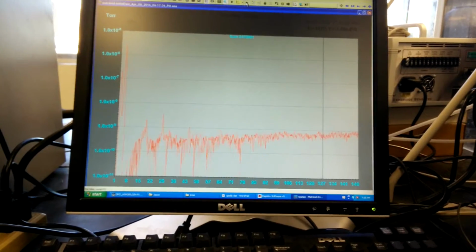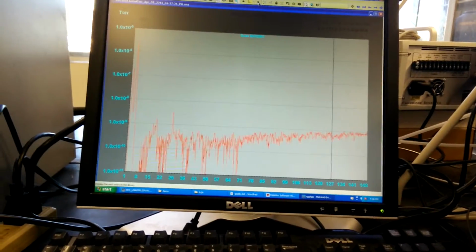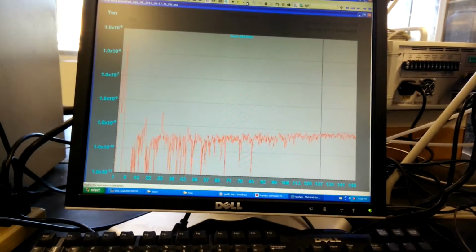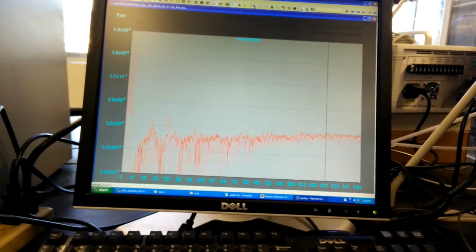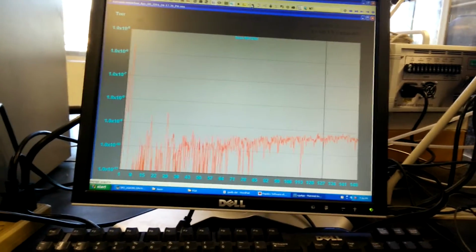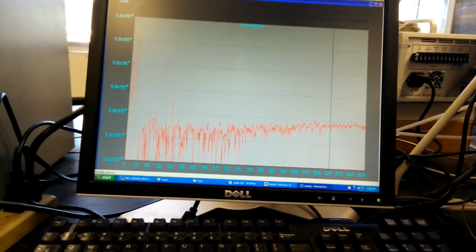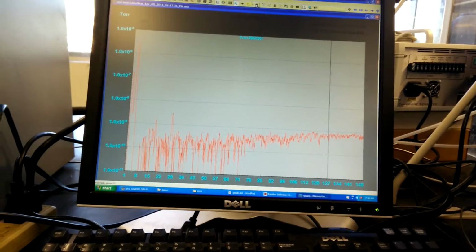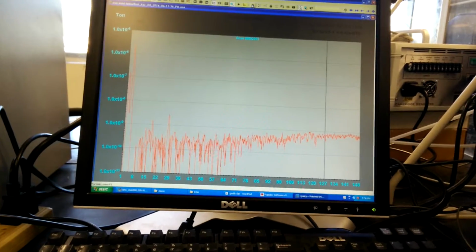So overall, the reaction for Matrimid is very similar to 6FDA in terms of what's coming off. There's appreciably more methane. Obviously no fluorinated compounds form, but there's definitely more methane, but we see the same key figures appearing here. So namely lots of hydrogen, nitrogen, CO2, CO, hydrogen cyanide, methane gas, all of those.